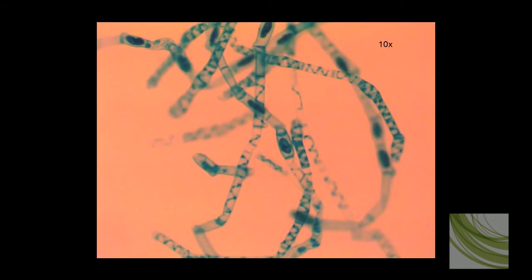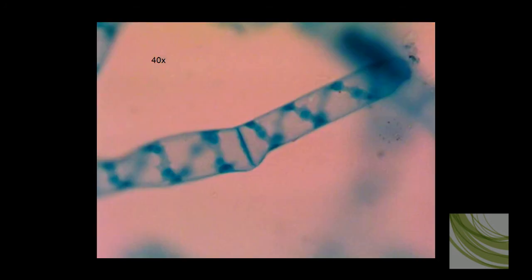Here is my first slide showing Spirogyra using the 4x objective. We can see the little strands, and you can even somewhat see some of the spiral pattern for which the algae takes its name. Here is the same slide using the 10x objective, and at this magnification, the spiral pattern of the chloroplasts up through the stem of the Spirogyra are even more apparent. Here I've zoomed in even closer using the 40x objective to get a closer look, and we can see the strings of chloroplasts that spiral up through the strand of Spirogyra.